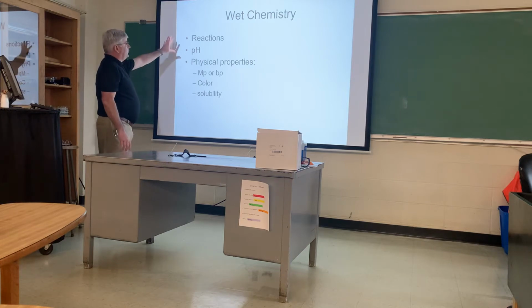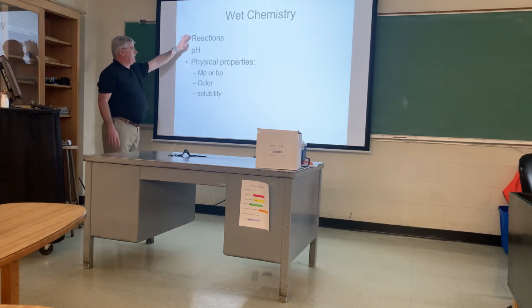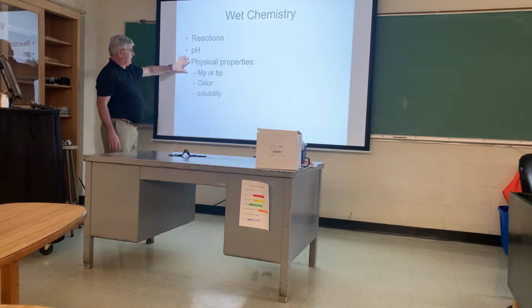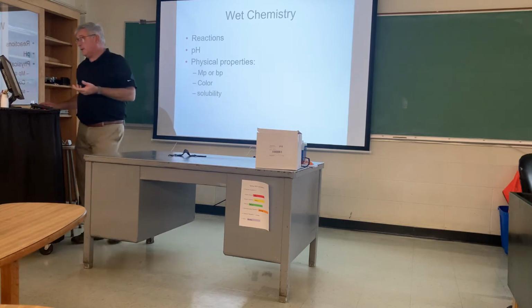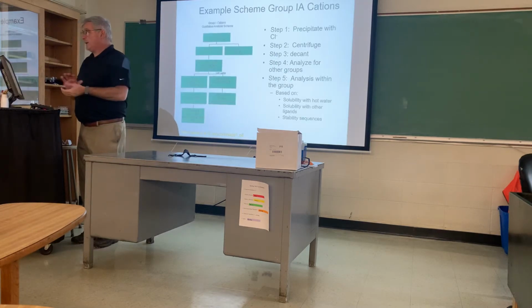But instead, we're going to do reactions, okay? And making sure our pH is appropriate. And so we're going to look at reactions with color and solubility. Those are the things that we're going to use to do our separation today.